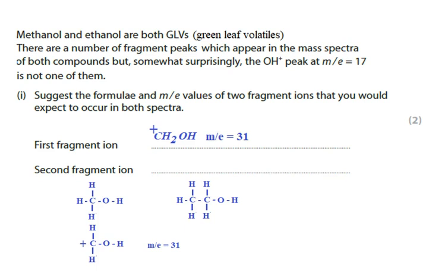Now, what other fragment do I expect to find? The one where I have the CH3 by removal of the OH. So I remove the OH and I'm left with the CH3 fragment. So this is something that will also be present in both of them.